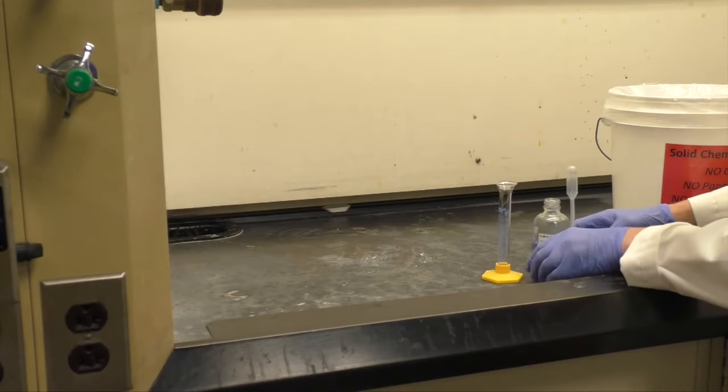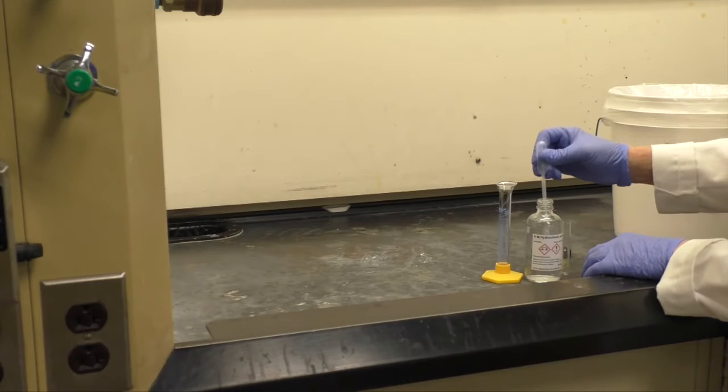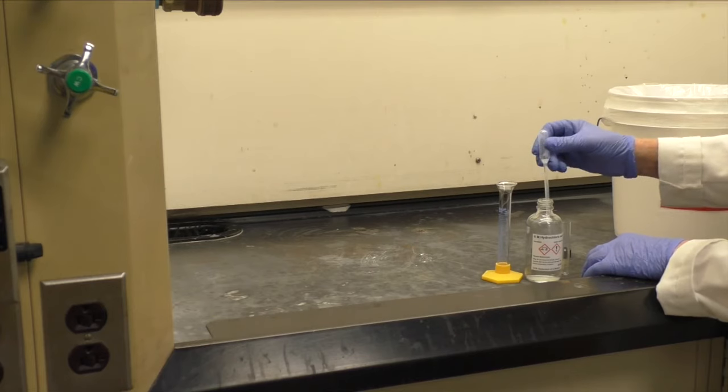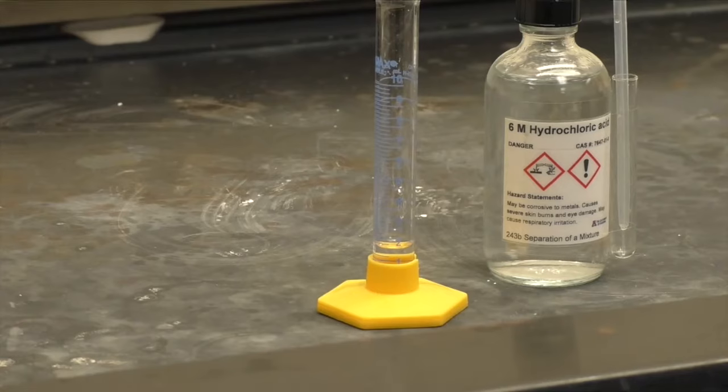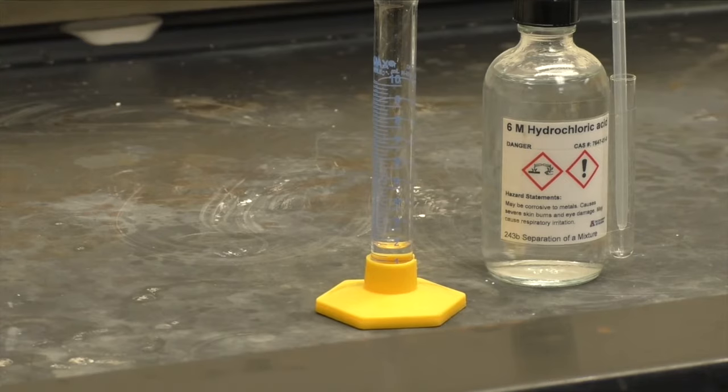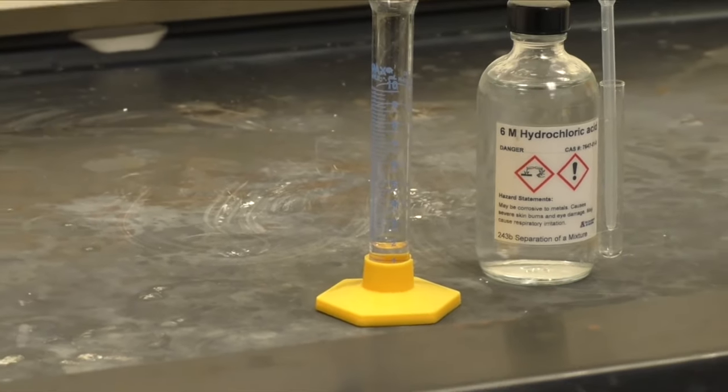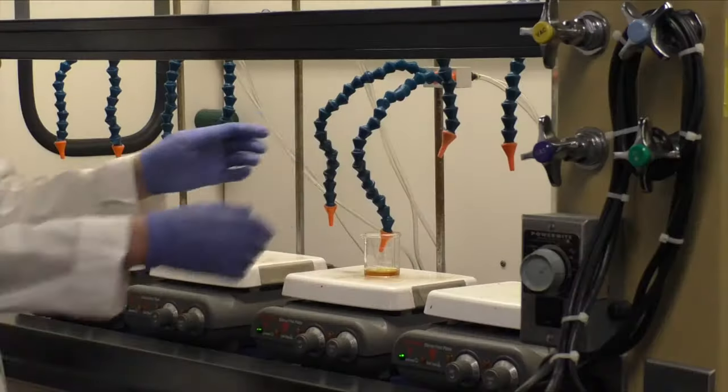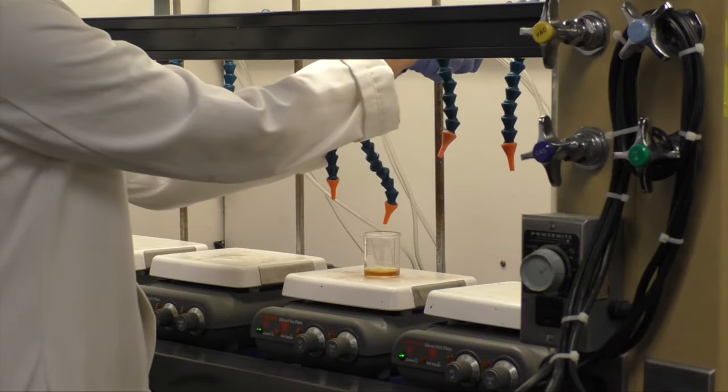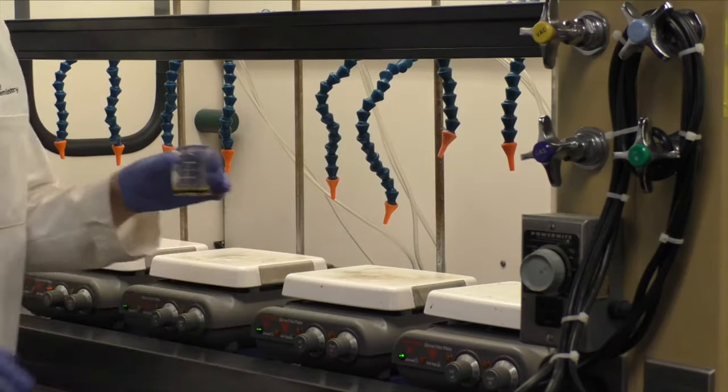While your solution is on the blow-down station, measure out 2 mL of 6 M hydrochloric acid into a graduated cylinder and take it to your bench. Remove your solution from the blow-down station and back at your bench.